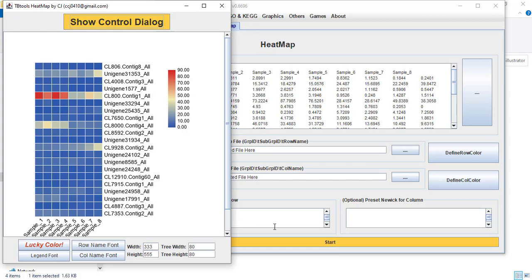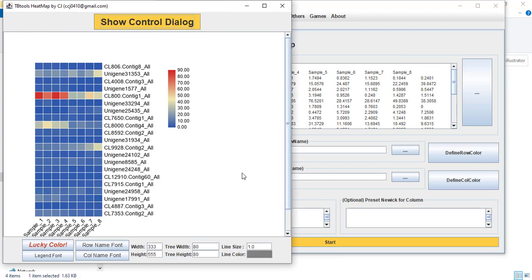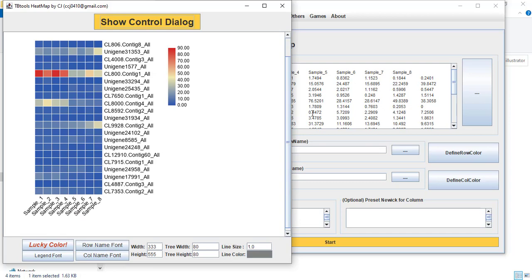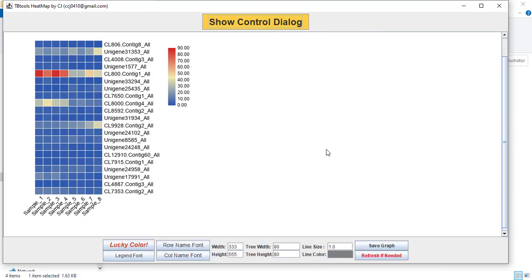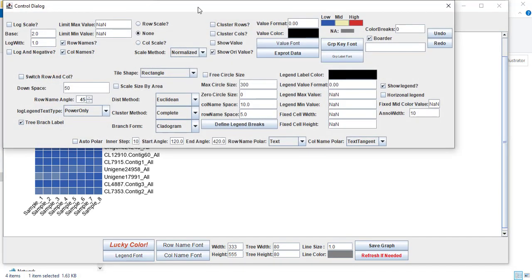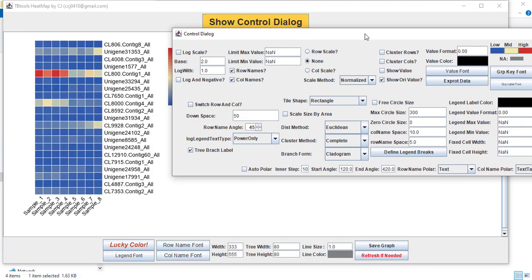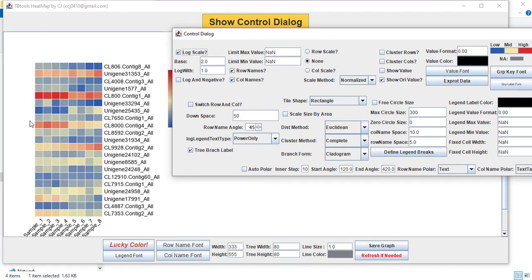Here you can see we have got a heatmap. We need to do some changes because this heatmap shows the expression simply by the values available. We can change it to log scale — you can see the expression level is changed.